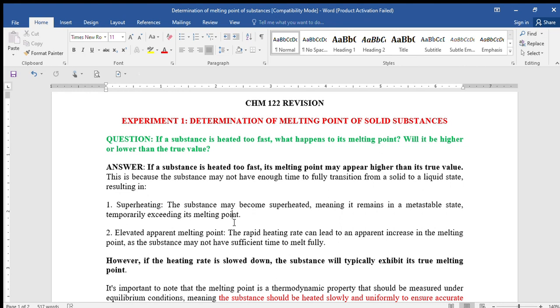You have to do it gradually. You don't have to be fast. And the reason is what you are going to use to answer question 2. So, to answer question 1, gradual heating, slow and steady heating, slow and steady temperature is needed. And so, for you to heat your solid, your sample, and observe an accurate melting point, you have to do a gradual heating.